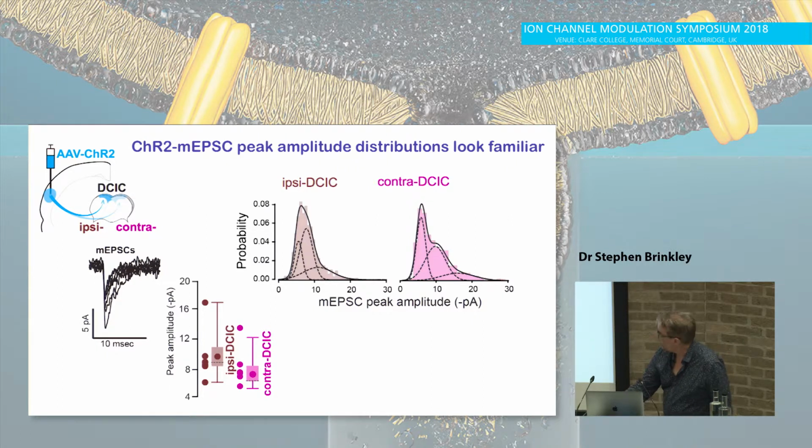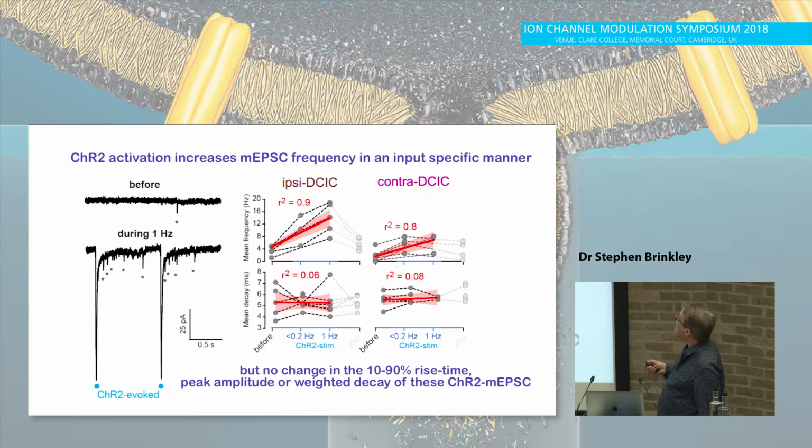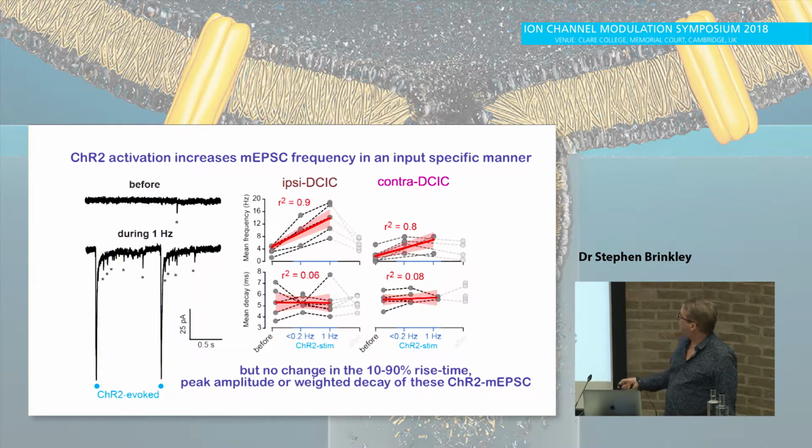Now, we also did this. I didn't show you the channelrhodopsin evoked minis. So this is stimulating at 1 Hertz, 1 every second. In between these evoked events, which are in the presence of TTX, of course, we see minis, and it clearly increased in frequency from the control data. This is at 0.2 Hertz, this is at 1 Hertz, and in terms of mean frequency, they increase, and then when you stop, they come back down again.